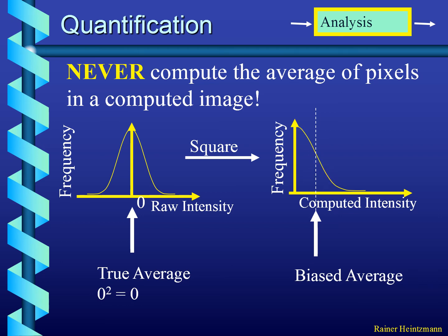And so you should always first average things together and then calculate the rest. That would mean in these lifetime things, you would first take the raw lifetime curves in a certain region of interest, then you average these curves together, then you're fitting this one average curve, and you can then display this lifetime that you get. And this will be a different result than fitting all the individual pixel curves and averaging the lifetimes together, which will bias you if you do so.